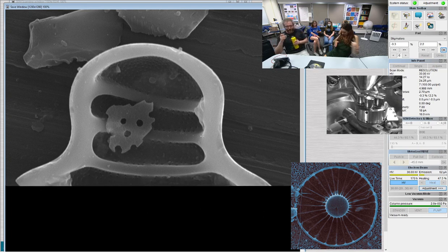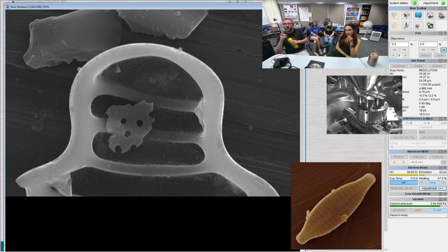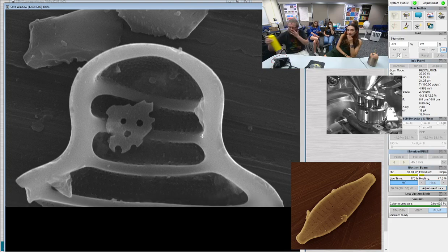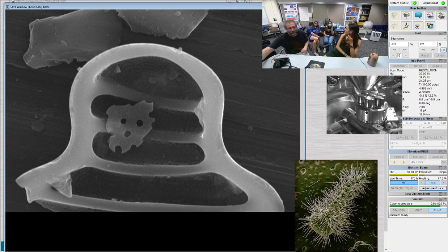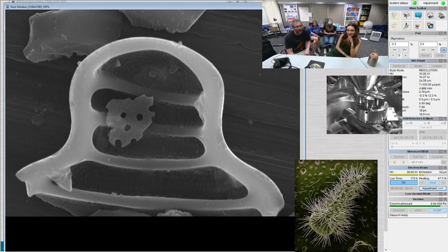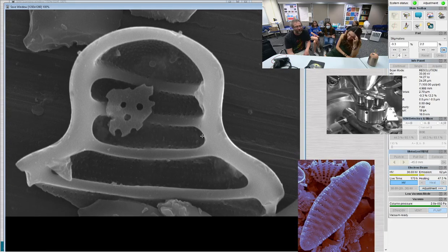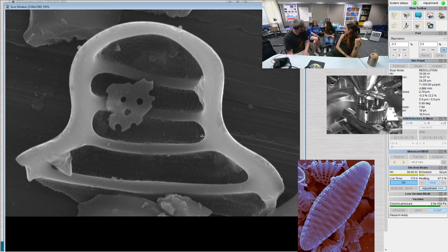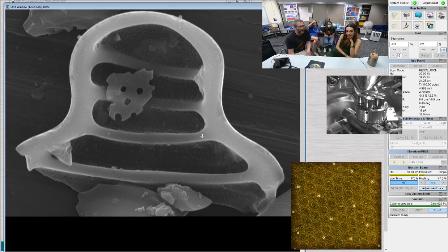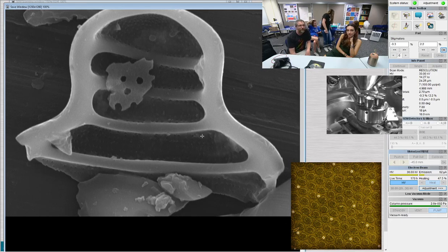Is that Stephanopyxis? No, it's actually not. It's something to do with Christ. Looking at it today. How is it not Stephanopyxis? What is it? I don't know. Naviculoid? No, it's a fragilarioid. Are you serious? It looks like Stephanopyxis. It does look like a Stephanopyxis. It's Star of David. Star of David has six points. A slice of cheese on top of it. That's Swiss. Pretty sure that's Stephanopyxis.